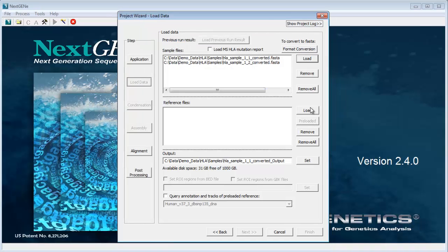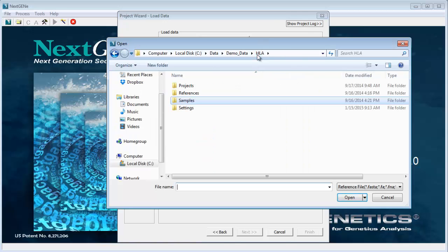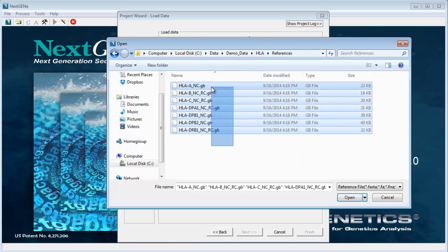Then click Load under Reference Files to load the GenBank reference files for the HLA genes that were sequenced.